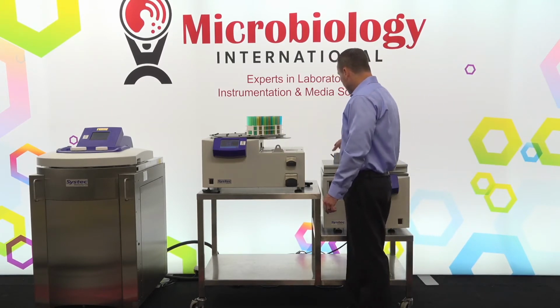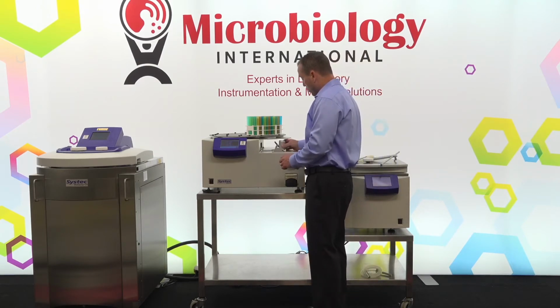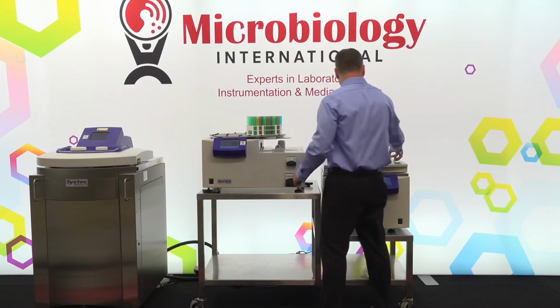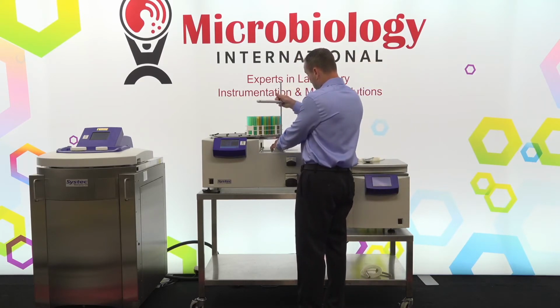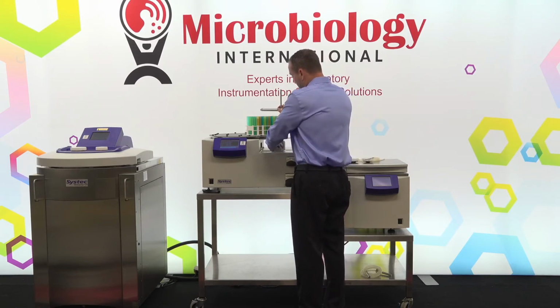So once the tube filling device goes on, then there is a small piece that fits into where the revolver would be in plate pouring applications. And there is a dispensing arm that goes into position. Once the dispensing arm is in position, we can just tighten this down.